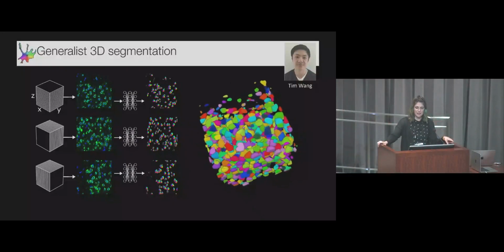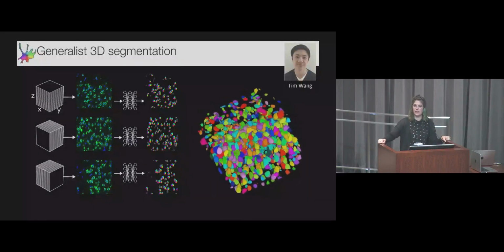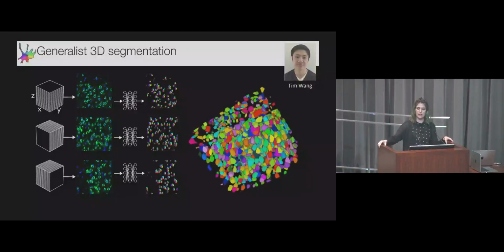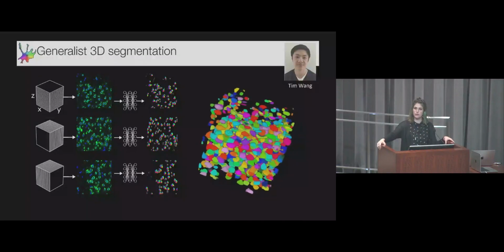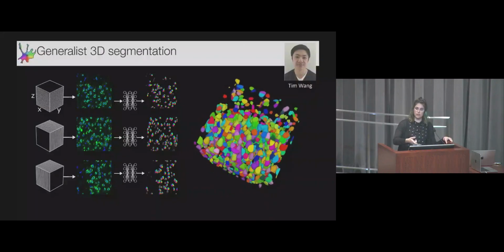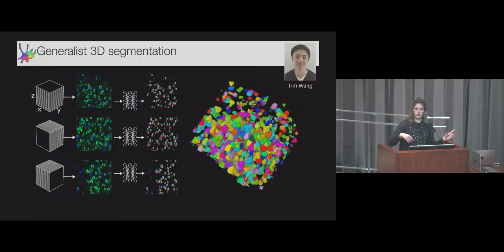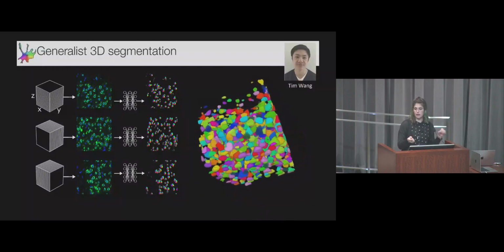Yeah, basically the reason we think Cellpose works so well is because of the diverse training set, and so it's really about getting a diverse training set in 3D, and we're starting to work on that now, with you and other people. If we can get a really large data set in 3D, we can train a generalist model ideally also in full 3D. I think in a lot of cases we can bootstrap quite a bit if the segmentations in 2D are good, to do some human in the loop in 3D. And I think there are also a lot of cases where the 2D to 3D approach is good enough, particularly if you take into account these anisotropy issues.